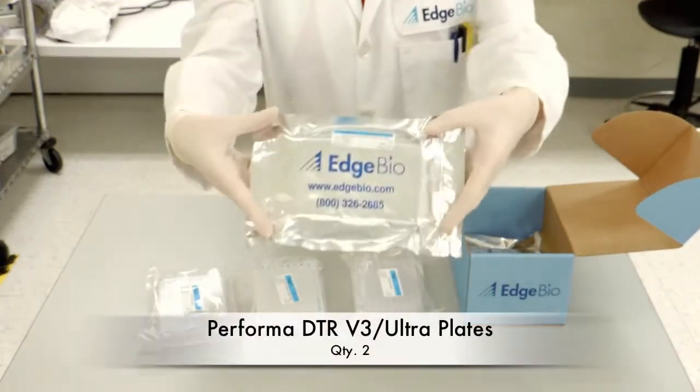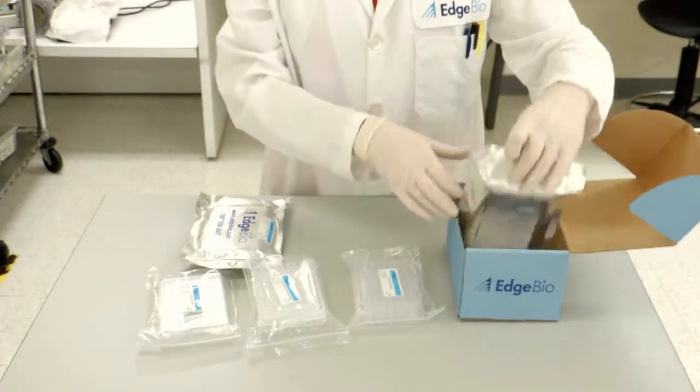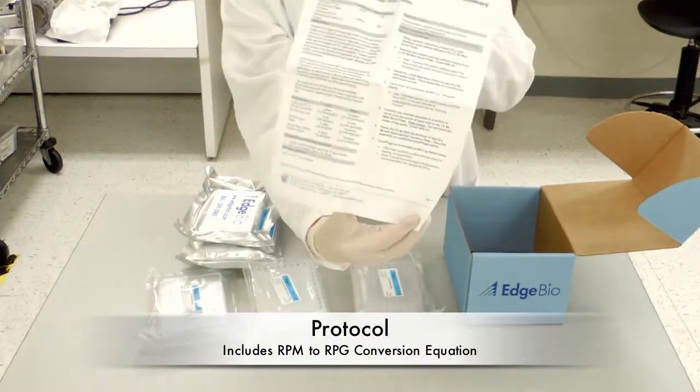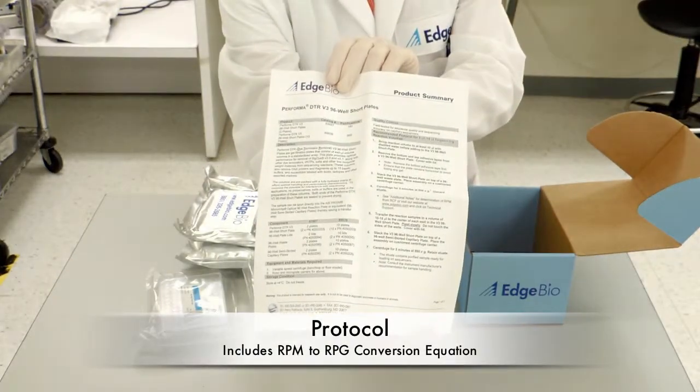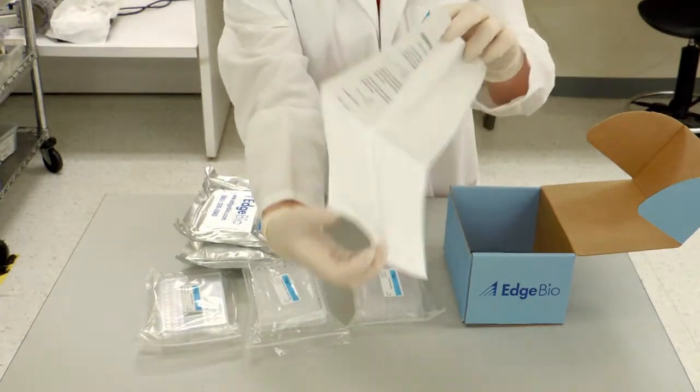Performa DTR plates, each individually wrapped within a foil pouch and labeled with a lot number, expiration date, and storage conditions, and finally, a protocol which contains detailed instructions about the product along with how to carry out RCF to RPM conversions.